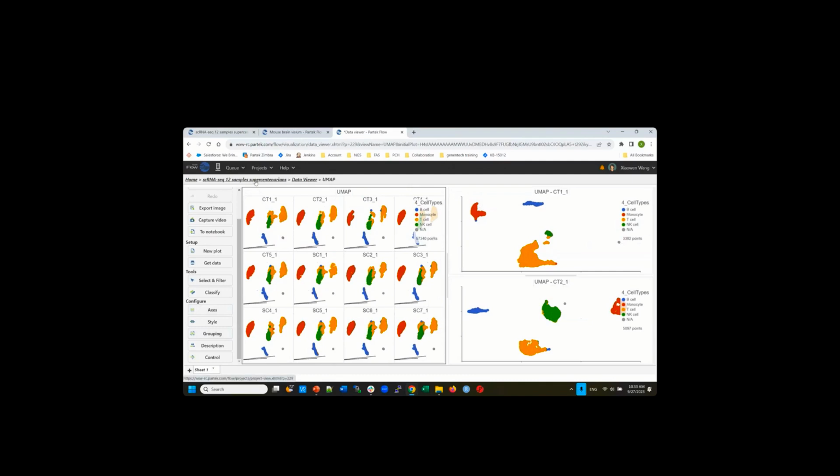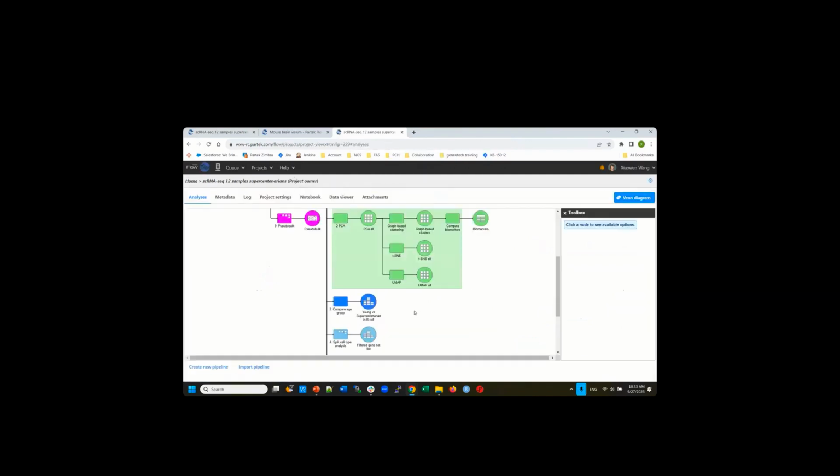Okay, so now I have all the cell types classified in the data. The next thing is your goal is to compare old versus young, right? When you design this experiment, you probably want to compare that. When you do bulk RNA-seq, all the T cells and B cells are pulled together.